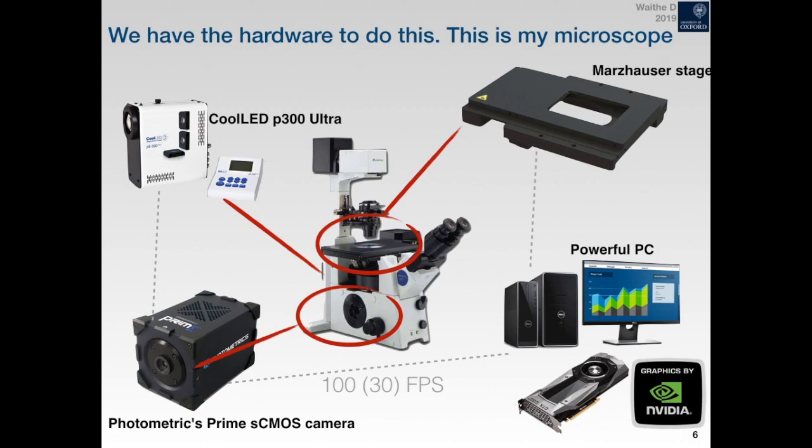So the way you can automate microscopes is pretty straightforward these days. You can buy automated stages, you can buy high performance cameras, and also a key thing are high performance lamps. These LED lamps that are now available are very strong. They're not really lamps, they're light sources. You can switch between the LEDs very efficiently. You can control it via the camera actually, so that it can be synchronized. And it really empowers you to do much more high performance automated microscopy than was previously possible.